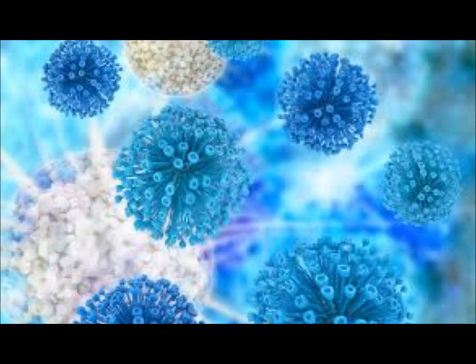So you tell me, you're a new tech, and I'm going to give you a set of 24-hour plates, and you have 10 different ones. What do you have to do? Tell me what you did yesterday. That's what you've got to do. Okay? So you tell me the first step. What plate did you look at first?